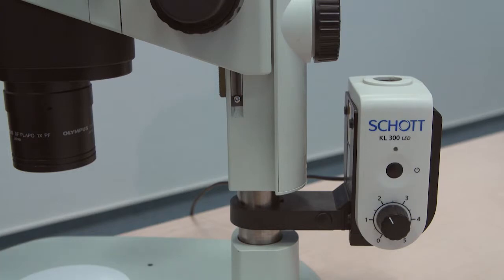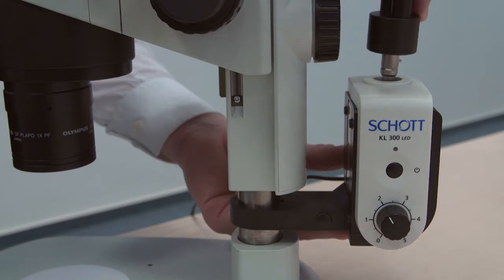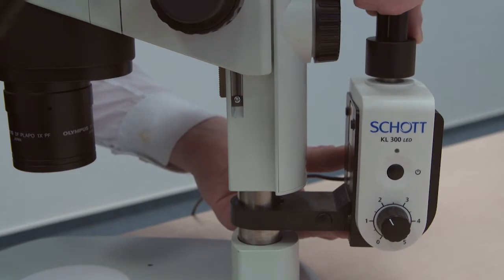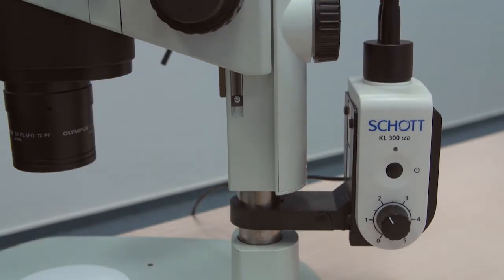The next step is to take the light guide. Please make note of the knob on the inside of the light guide — it needs to be aligned with the slot inside the KL300 LED. Simply push it down until you hear a click. Now you are ready to operate it.